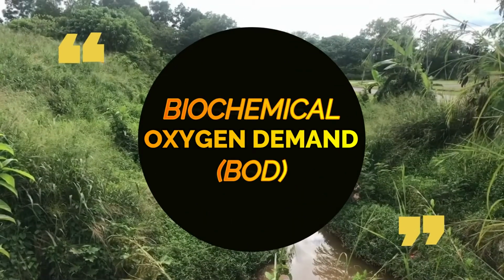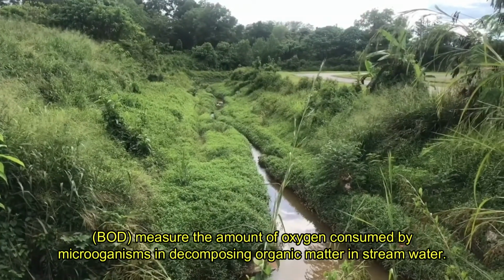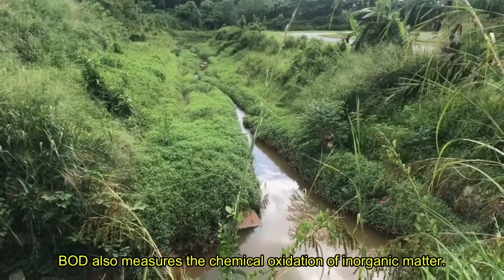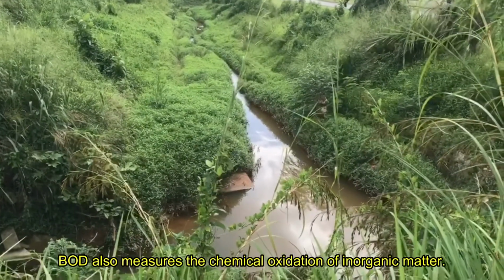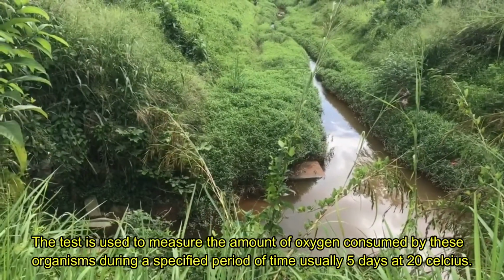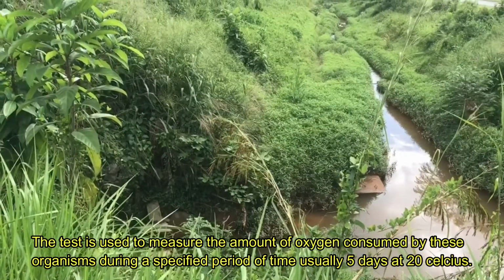Introduction of biochemical oxygen demand, BOD. BOD measures the amount of oxygen consumed by microorganisms in decomposing organic matter in stream water. BOD also measures the chemical oxidation of inorganic matter. The test is used to measure the amount of oxygen consumed by these organisms during a specified period of time, usually 5 days, at 20 Celsius.